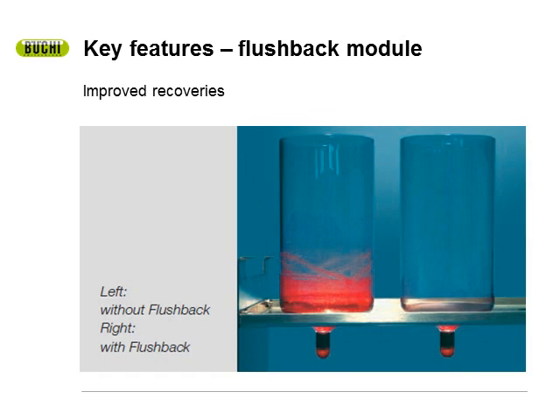And if you go back to how I mentioned you can control your results with the Syncore, well, this is one of them. For instance, a recirculating chiller is flowing through the rack itself, and it's flowing through the flushback module itself. If you want a very high analyte recovery rate, you can use a low temperature on the recirculating chiller so it gives more of that rinsing effect during the evaporation process, and it'll cleanse off the walls more and more.